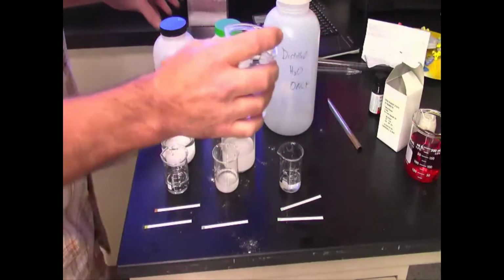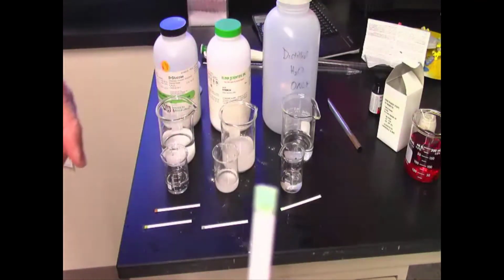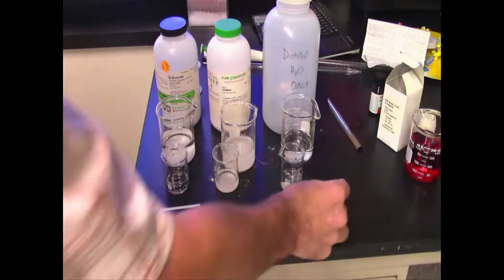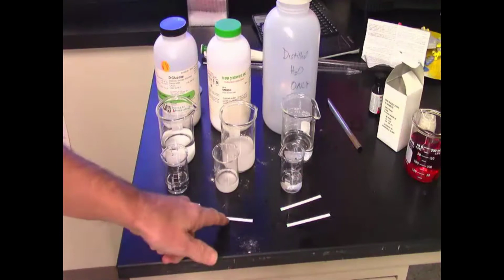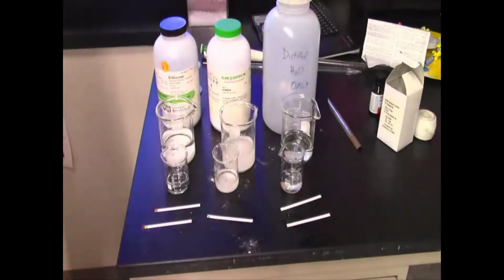And then this is distilled water, and I put the tabs in, put one of the strips in there too, and that didn't change either. So that's the test for glucose. Now we're going to do a test for starch.